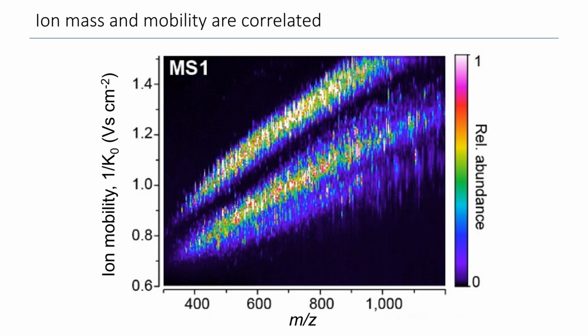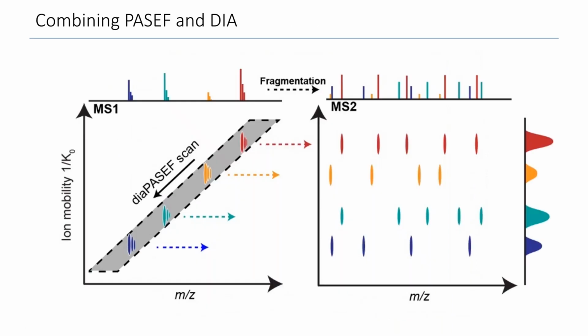So you could imagine the mass spectrometer is seeing this heat map here slowly building up, going from the top to the bottom. And at any time, any single mass spectrum only sees one row of this two-dimensional heat map here. And we thought this should be especially helpful for data-independent acquisition, because it exactly overcomes this problem that I explained before, that when we are isolating a certain m/z window, we are not looking at all the other m/z windows.